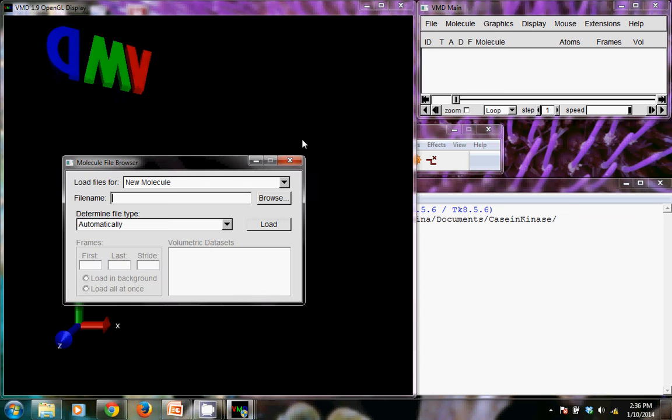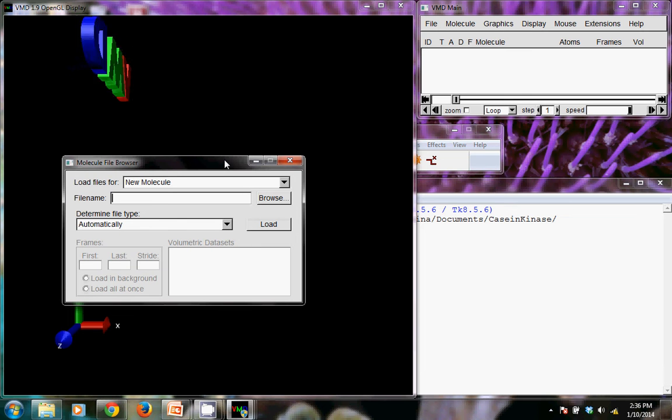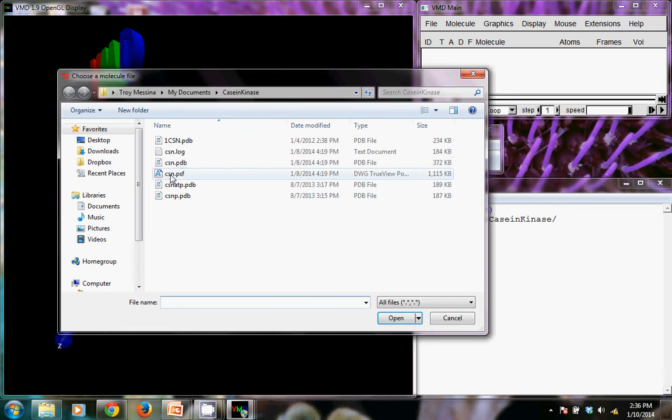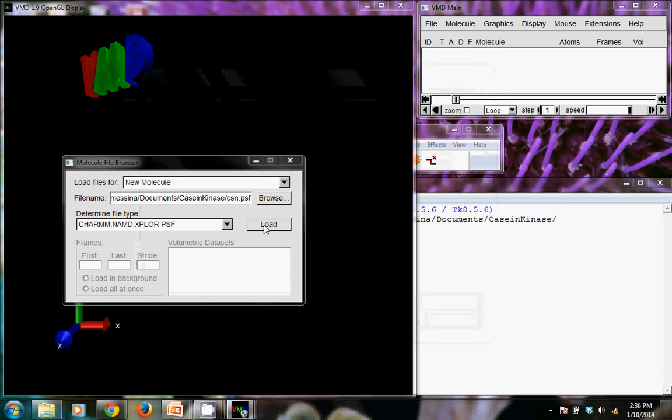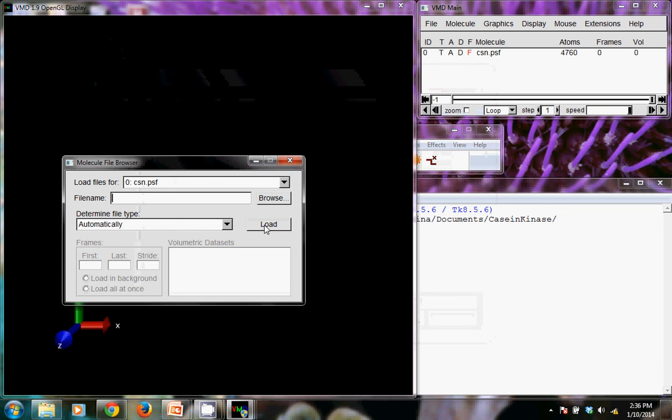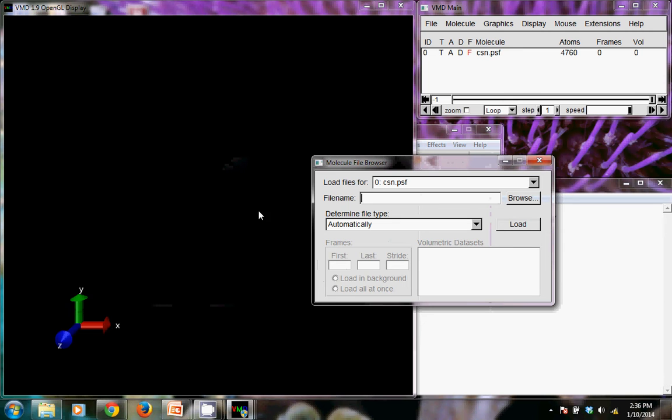I'm going to load the molecule that we just created. So that was this CSN. You need to first load the protein structure file, and you'll notice nothing happens here in the display window.